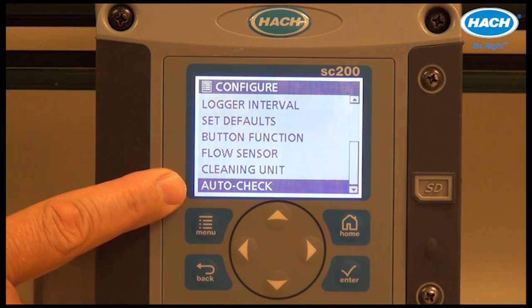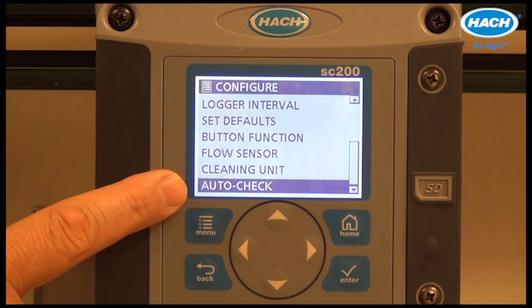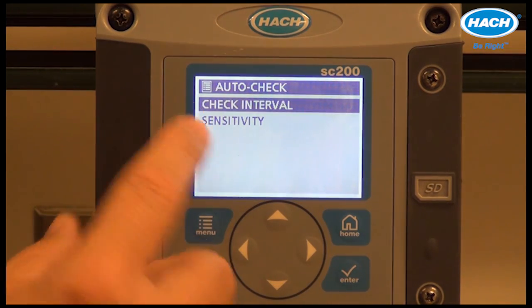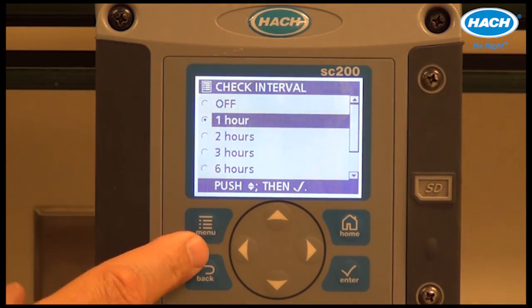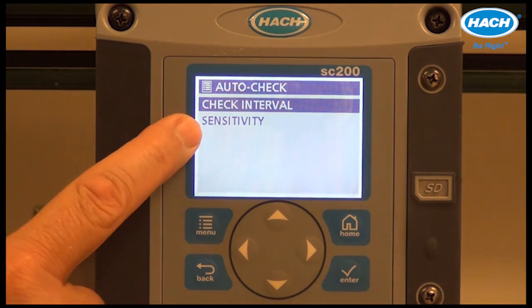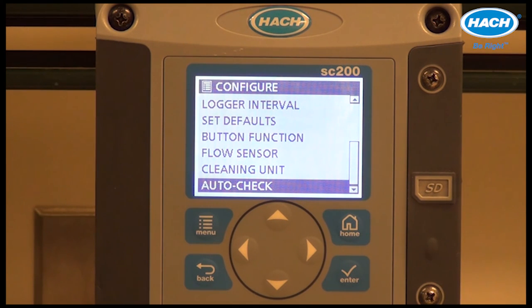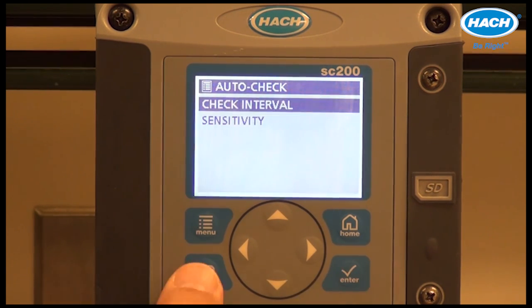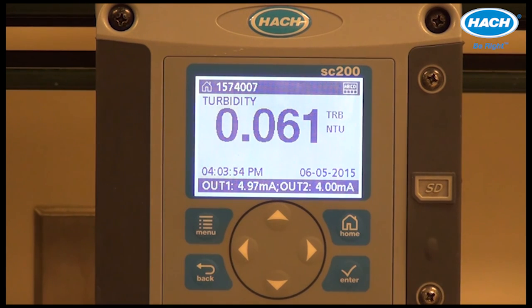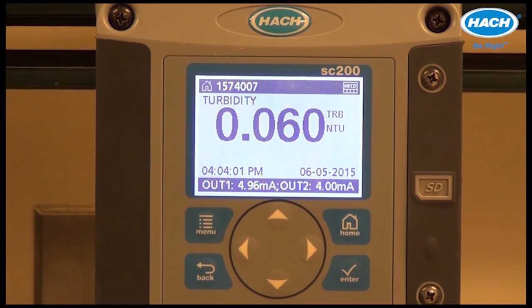Finally, auto-check is a very nice feature that can be set up at a variety of different intervals, with different sensitivities selectable. Auto-check is a tool that can periodically verify the cleanliness and clarity of the vial used in the instrument. This concludes the basic operation of the TU5300 and TU5400 online turbidimeters.